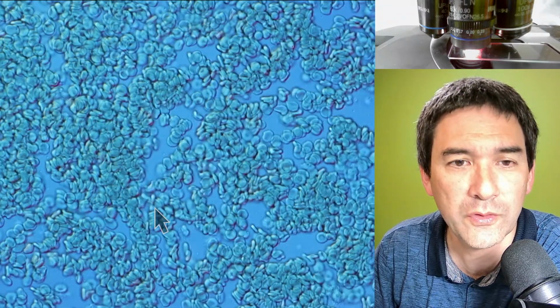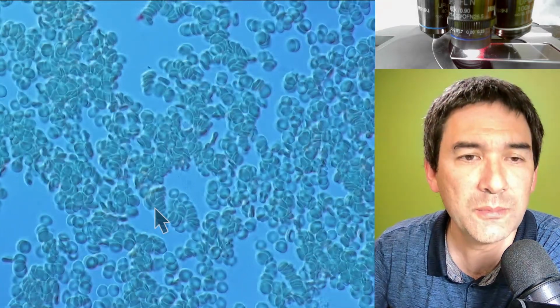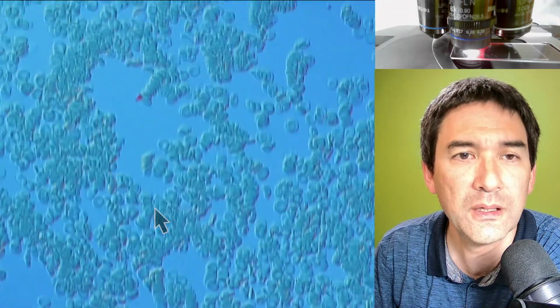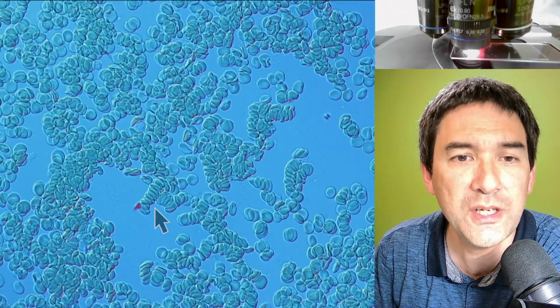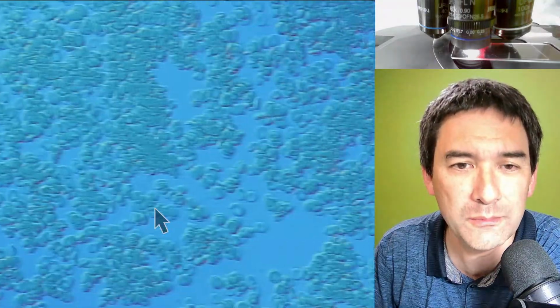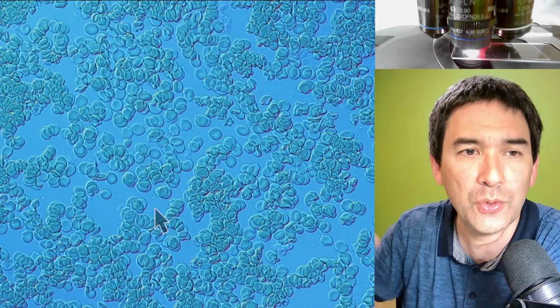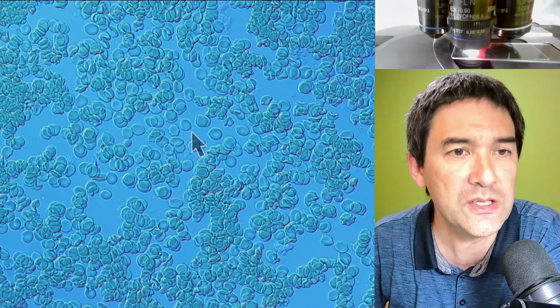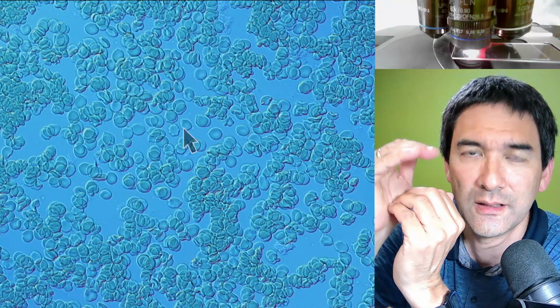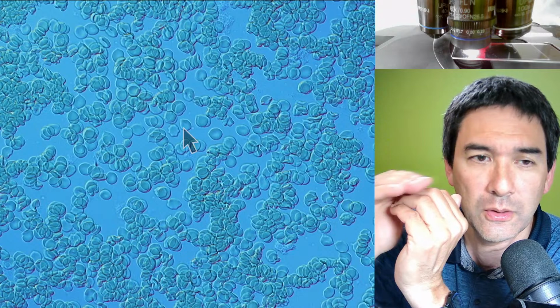So let's move over here to the side. Maybe there are fewer cells, because sometimes if there are fewer cells visible, it's also easy to see the white blood cells. If you go here to the side, and the layer of blood is very thin, you're going to see that most of the cells will start to lie flat because they're compressed between the cover glass and the microscope slide. So for this reason, they are not able to stand up, but are compressed flat.